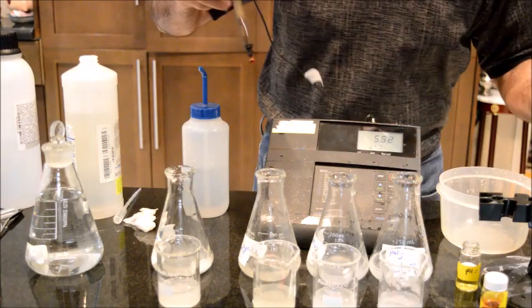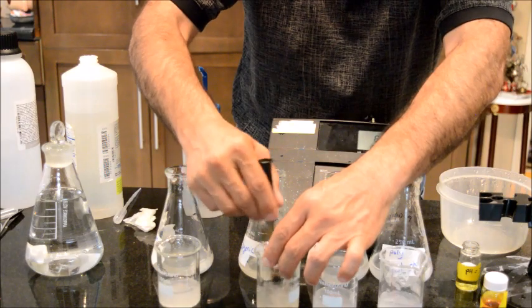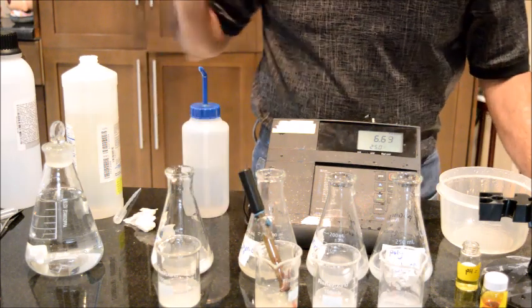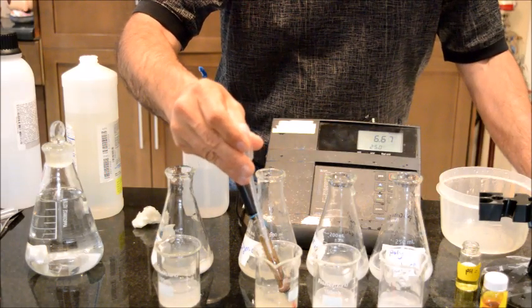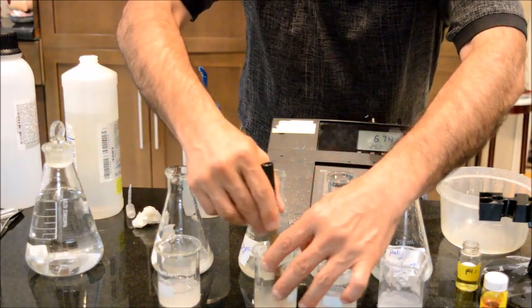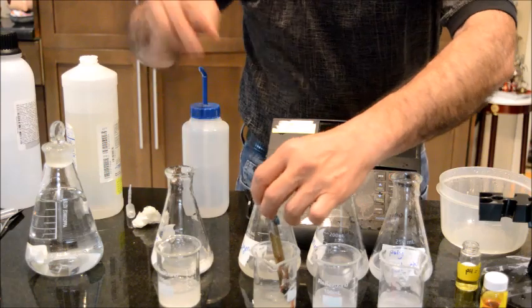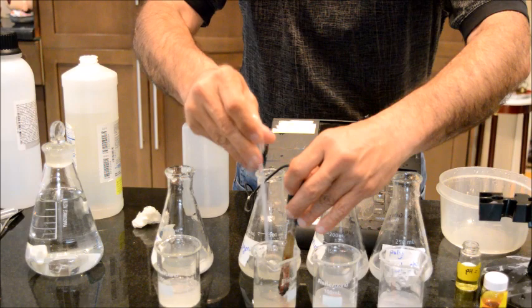Next one is sodium alginate 2%. It is already very viscous and hard to stir. So sodium alginate 2% is already, again, pH 6. I'm going to use diluted hydrochloric acid to decrease the pH to around 4.2. This is for the consistency of the study, so that all our gelling agents will have similar pH, similar to the simulated vaginal fluid. So that's the intention.